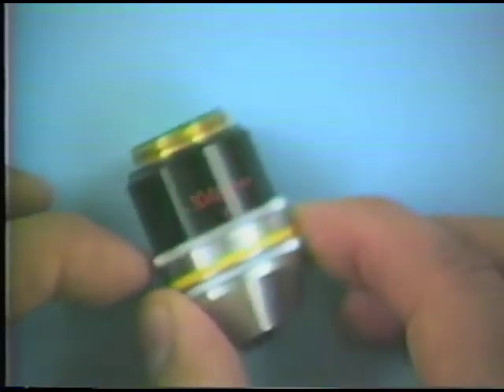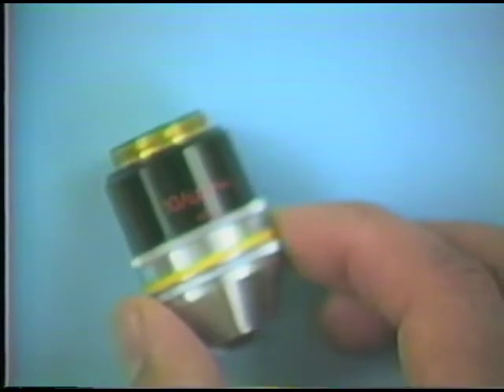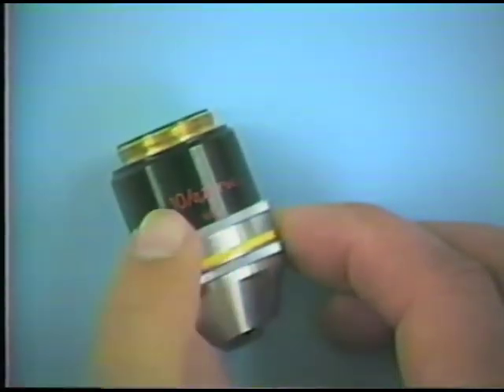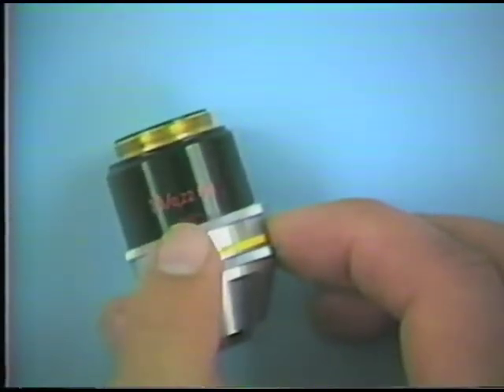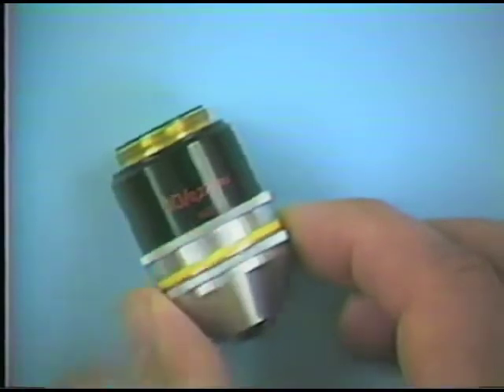If we look at an objective closely, which I have one here, the typical kind of notation on them is that they will show a power. This one is a 10x objective, and then there'll be a number following this, which in this case is 0.22. This is the numerical aperture, which I'll explain in a minute.